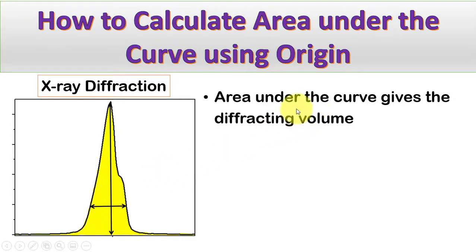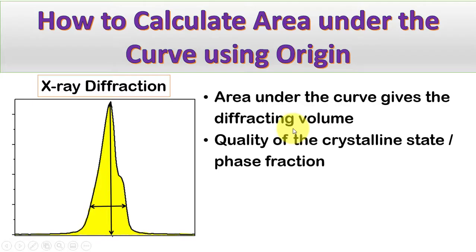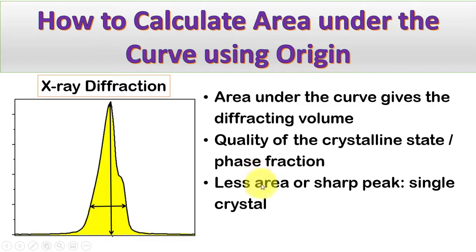As I know, the area under the curve will give me the total diffraction volume. And it gives, in other words, the quality of the crystalline state, which we call a phase fraction. Less area or sharp peak will indicate single crystallinity, and the wider peak will be an indication of a polycrystalline state.